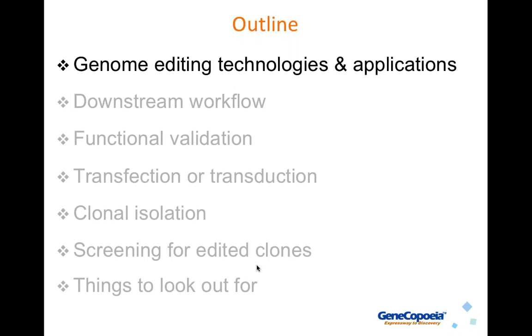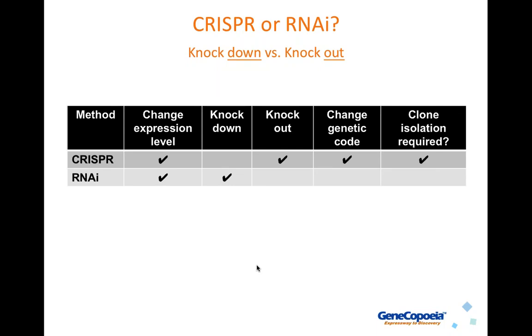All right, so let's talk about the background for genome editing technologies and applications. So one of the main applications for CRISPR, though by no means the only one, is to do gene ablation studies. So for many years, it was always very difficult to, say, get rid of gene functions in higher order cell systems. It's always been traditionally easy to knock out genes in, say, yeast and bacteria, but to do things in mammalian cells or even organisms like C. elegans or Drosophila was rather difficult.